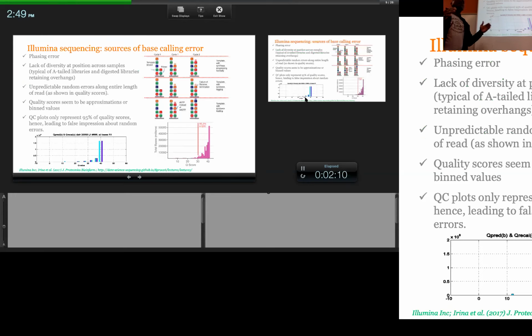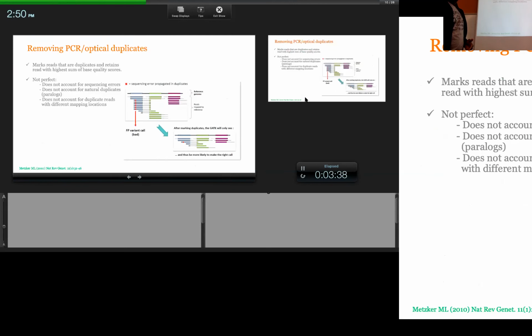So it's essential that you start off clean, and the way to start off clean is by making sure you have enough diversity, a variable length barcode, to give you a clean start and carry you all the way. We talked about optical duplicates because you have PCR bias sometimes. You tend to amplify smaller fragments faster or better than larger fragments.